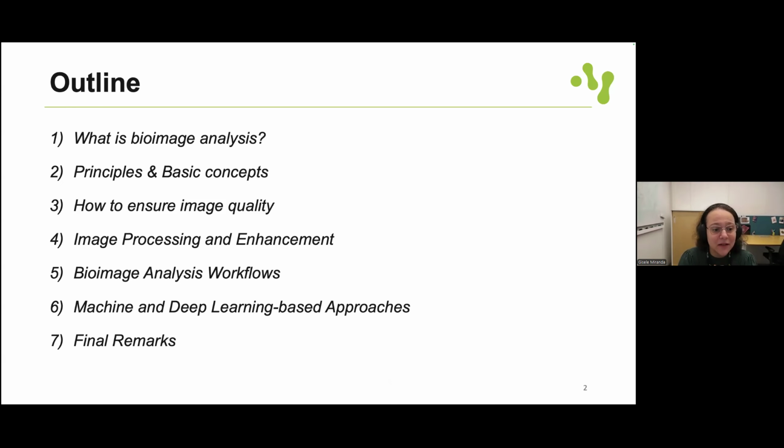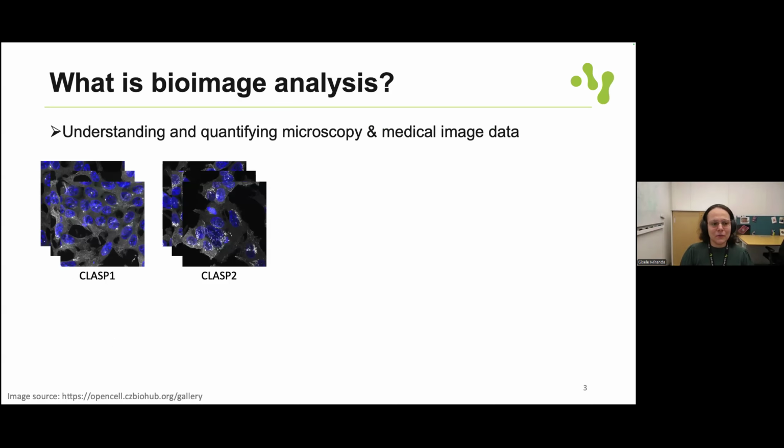We are going to talk a lot about image quality, especially in the workshop, how to ensure image quality for image analysis. We are also going to cover some image processing, pre-processing techniques and enhancement. We are going to see some typical bioimage analysis workflows and an overview of machine and deep learning based approaches for image analysis. So here I'm going to use bioimage or image analysis interchangeably.